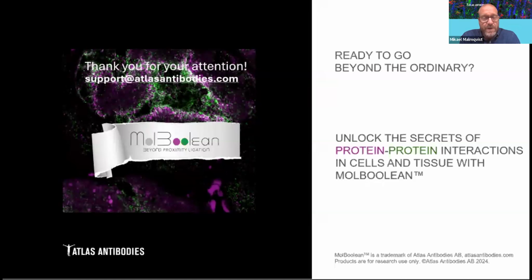Any advice on choosing primary antibodies? I think I can answer that. Like I mentioned, it's important, if you can, to find out the epitope where the antibodies are binding, and whether those epitopes are masked for the protein interaction. If you don't know the epitopes, you can do a co-IP, like Ola was mentioning, to see whether you can pull down the proteins together and whether the epitopes are masked when the proteins are in a complex, first, before you proceed to do the MolBoolean.